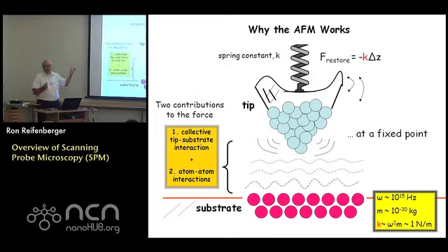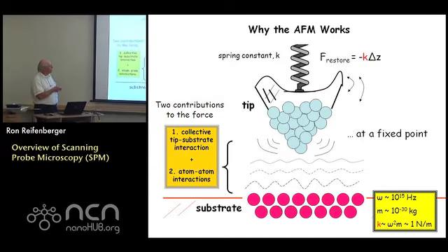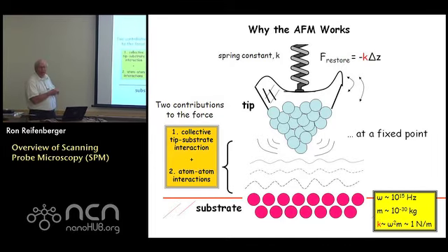So, in principle, if you took introductory physics, you would understand these principles. You may not know how to calculate these interatomic forces, but you would know that a stretching of the spring is counteracted, right, by this elastic restoring force K delta Z, right? And if you understand that, you understand how an AFM works fundamentally. The details are a little bit more complicated, but this is the basic idea. Okay?